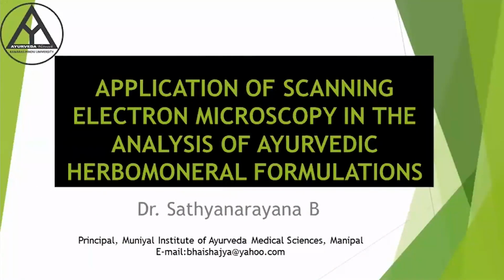Considering the length of the topic, I have planned to divide my presentation into two parts. Today I will be focusing on scanning electron microscope, and in the next class I will be talking on its specific and general applications.